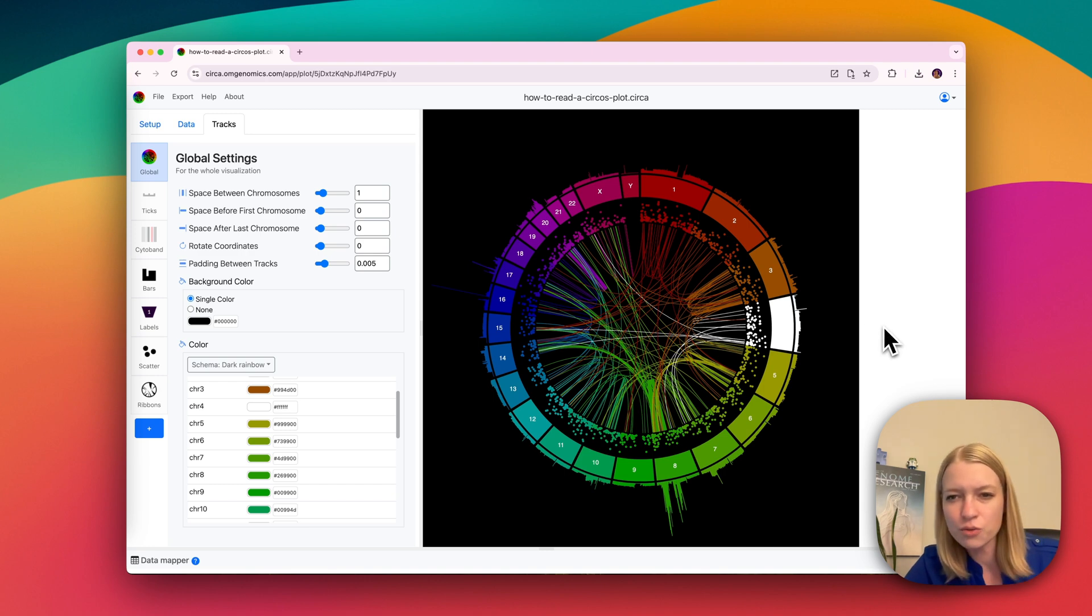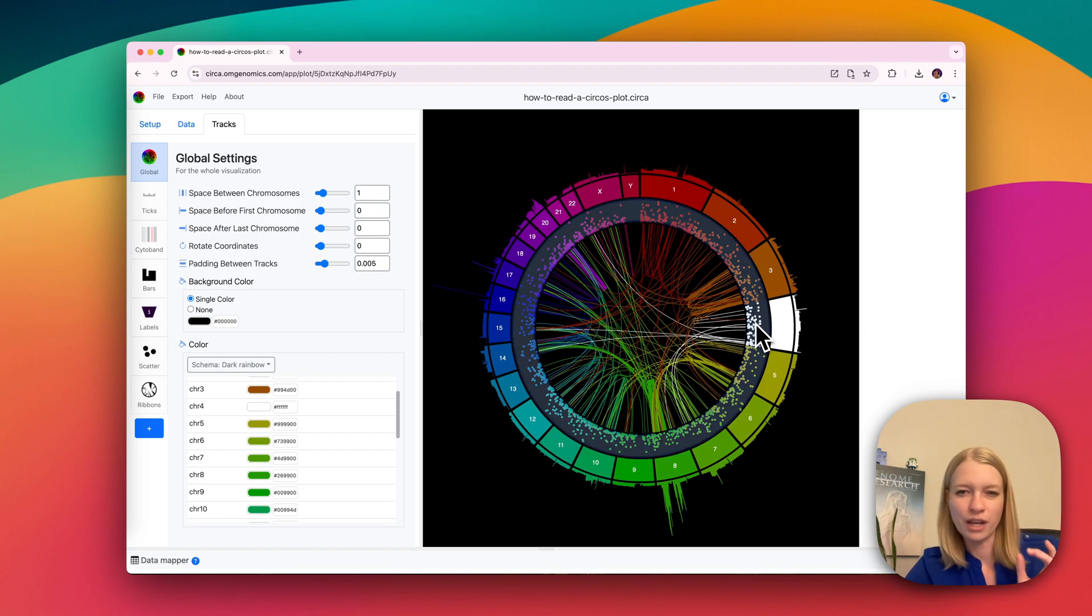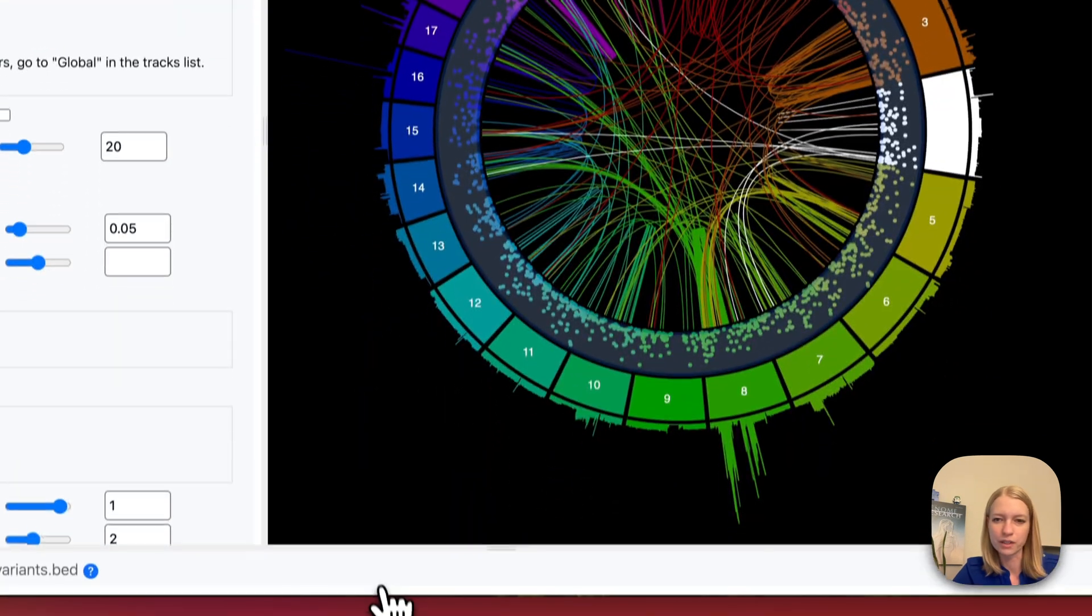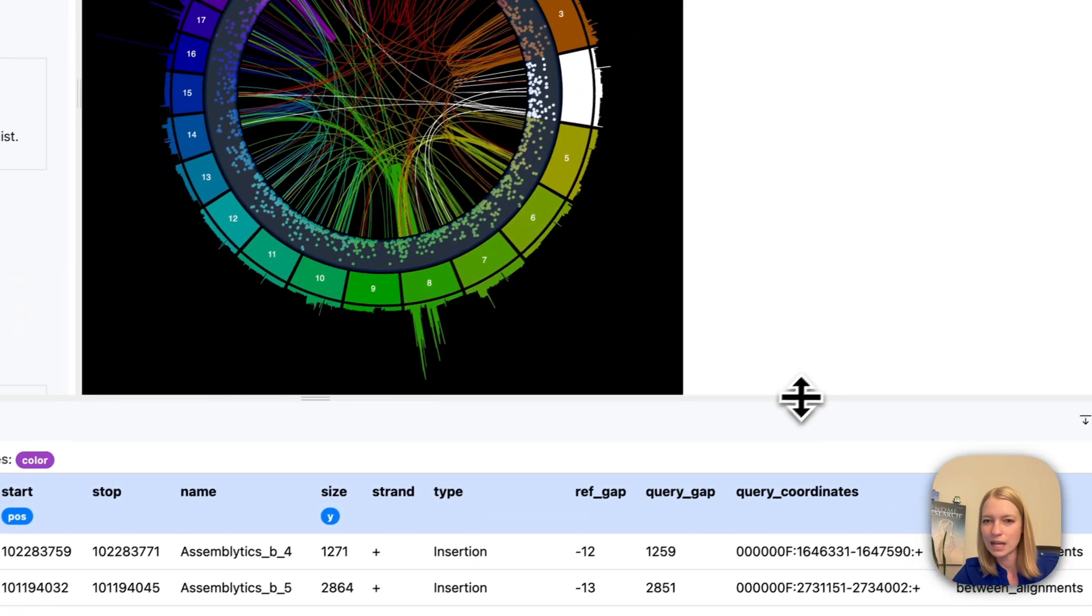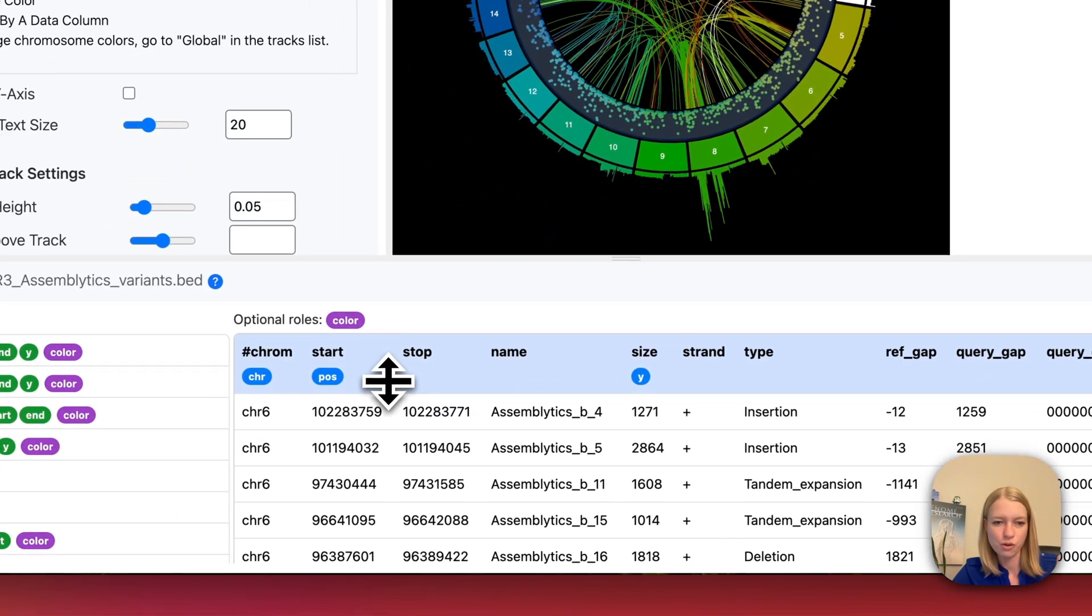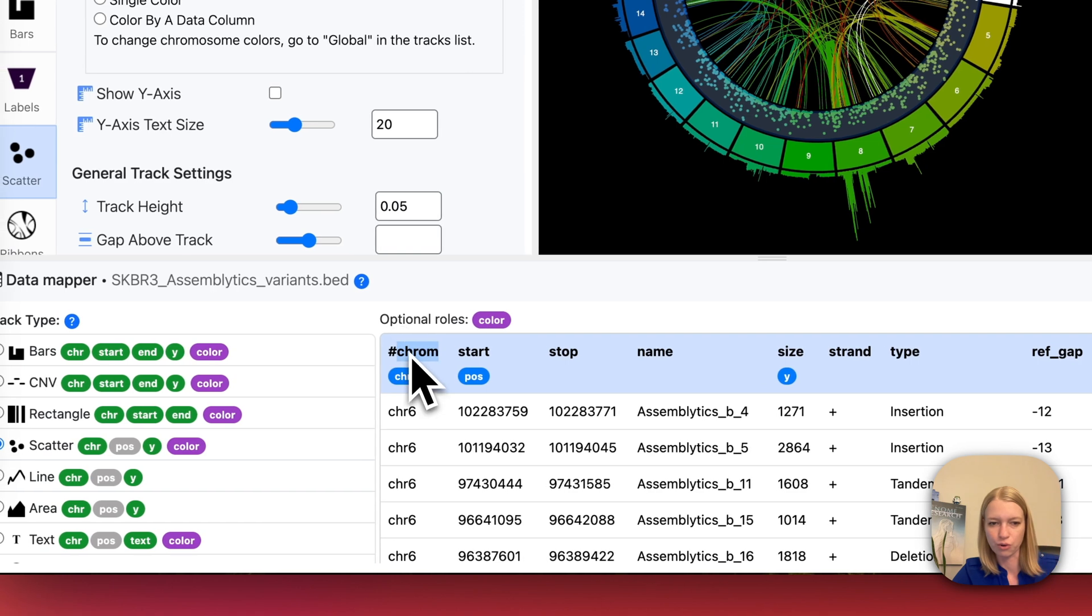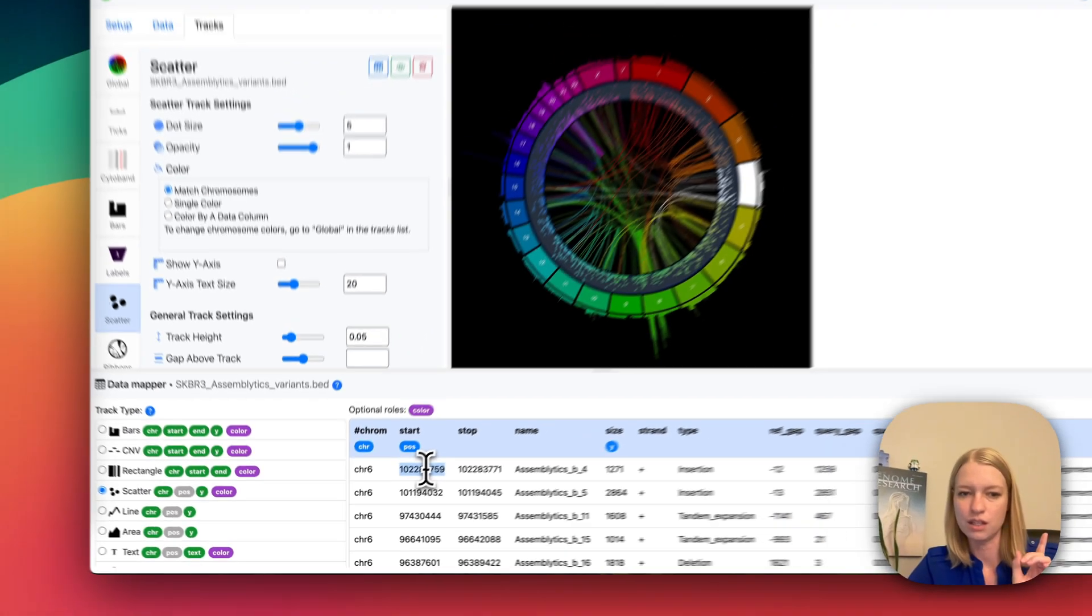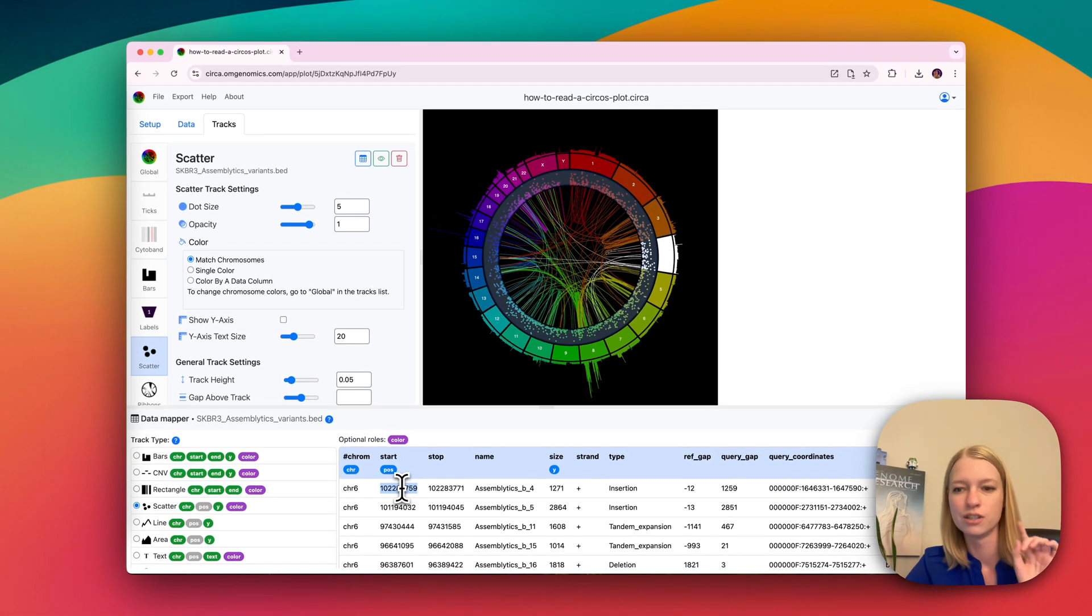And in order to read the data itself, what we will generally see, a scatterplot is probably the easiest one to visualize here. The type of data that we're looking at here is you're always going to have a chromosome name and some kind of position that is for every single data point.